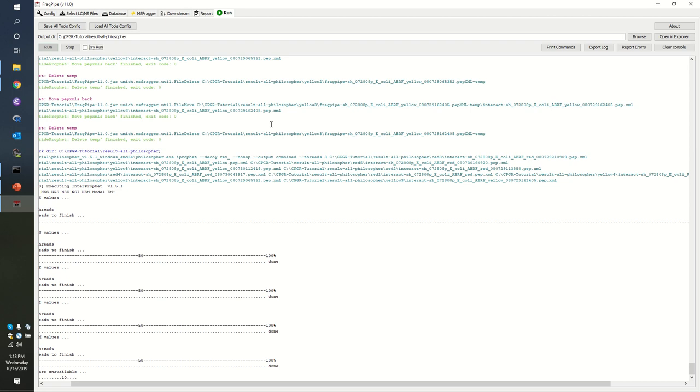So we now see that InterProphet is running. The software is getting to the stage where it's trying to do a protein inference to say which proteins have been observed based on the peptides that have made it through our PeptideProphet filtering. This process in E. coli is a really easy thing to deal with because in most cases a peptide observed in E. coli can be explained by only one protein.